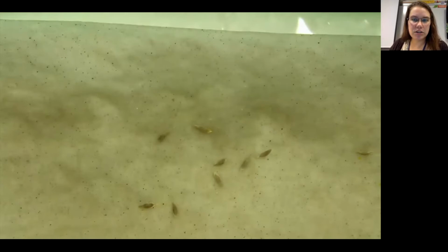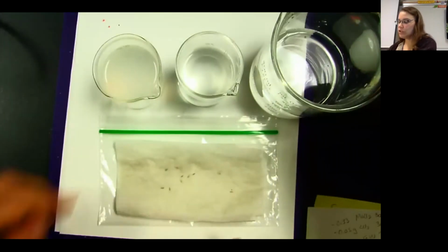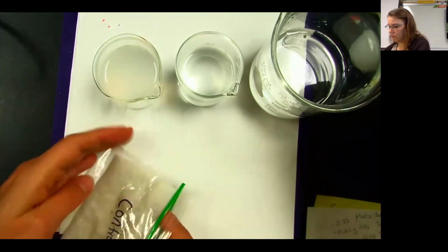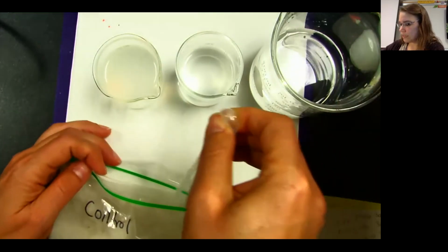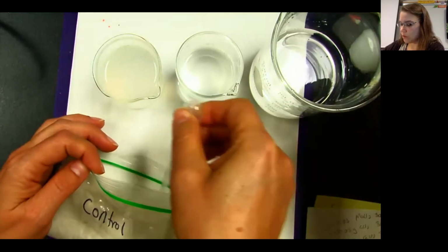So this is what those seeds look like. Okay, they each are an individual seed. I'm going to put these into my baggie. I'm going to add a little bit more water because I want to make sure that they've got plenty of water, that they're not going to dry out as I let them grow.